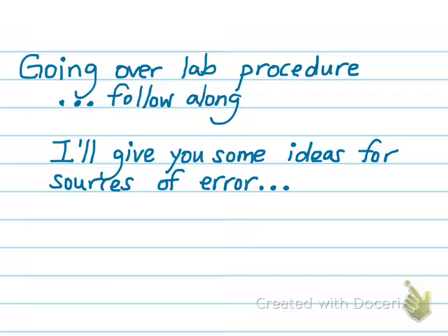Safety first. In this lab, the crucible you are working with will become quite hot and could cause a severe burn if handled improperly. Observe all precautions, especially the ones listed below. If you see a safety icon beside a step in the procedure, refer to the list below for its meaning. Caution: wear your safety goggles, all steps. Caution: do not look directly at burning magnesium. Do not inhale the smoke produced when the magnesium is burned.